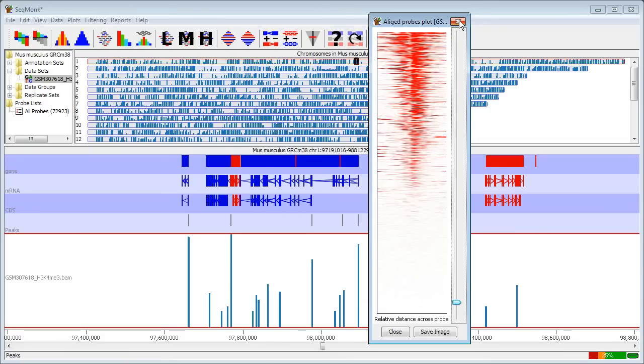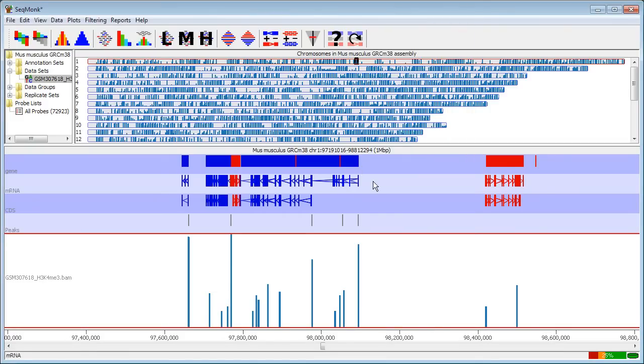So in these two simple ways of looking at ChIP-Seq data, we can either get a global view of the enriched regions using a statistical analysis, or we can look thoroughly at every single transcription start site, looking at the bias of positions around it and quantitating over those regions.